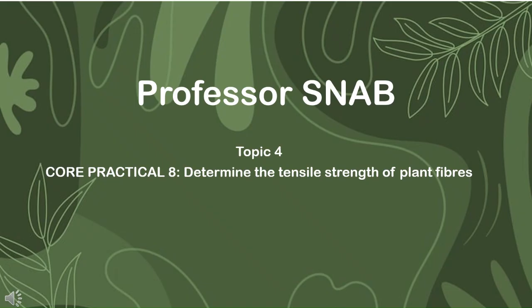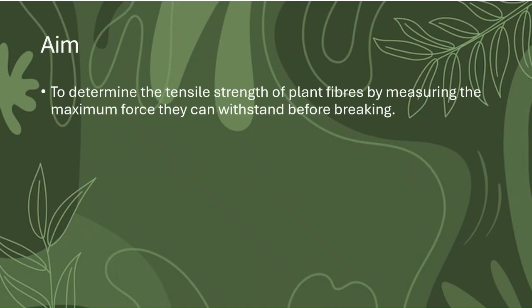So today we're looking at another core practical. This time we're focusing on determining the tensile strength of plant fibers. The aim of this practical is to determine the tensile strength of plant fibers by measuring the maximum force they can withstand before breaking.